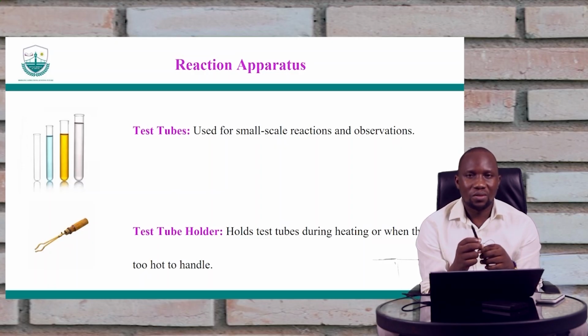Okay, so we have the test tubes. They are very good for carrying out small tests. If you want to see the reaction of, let us say, solid.